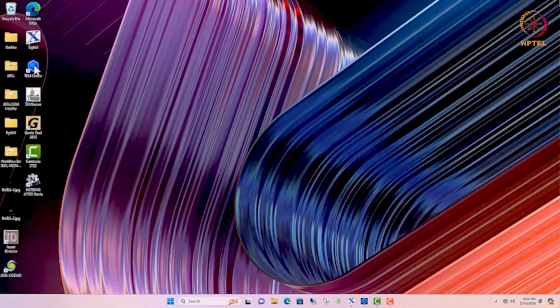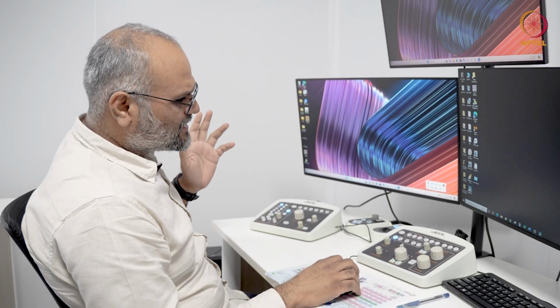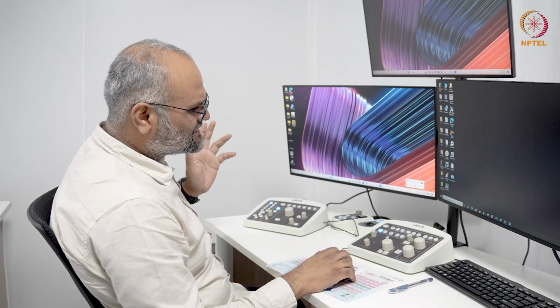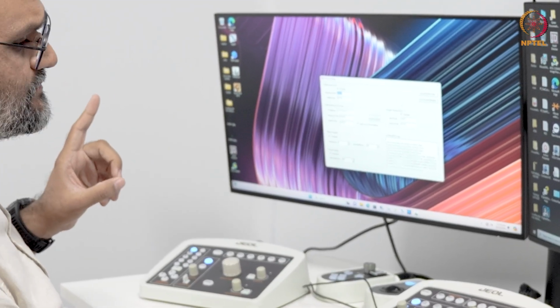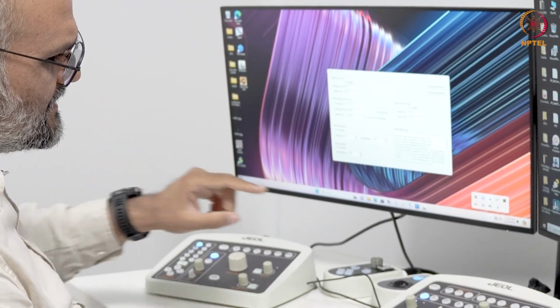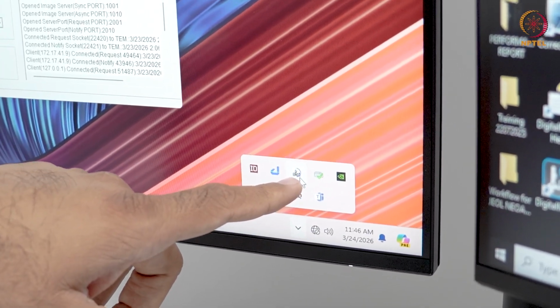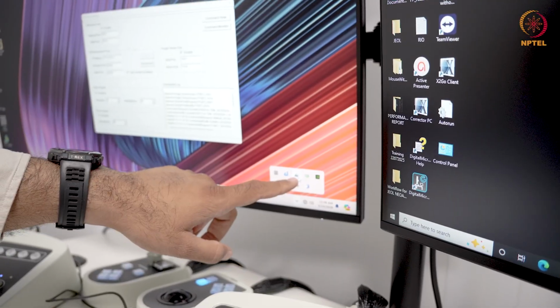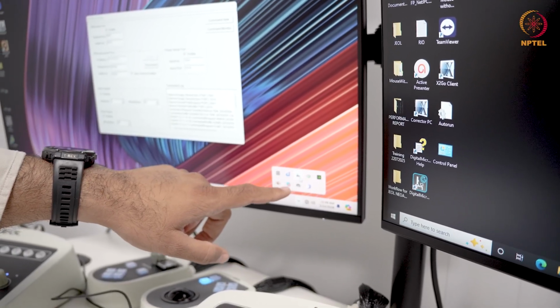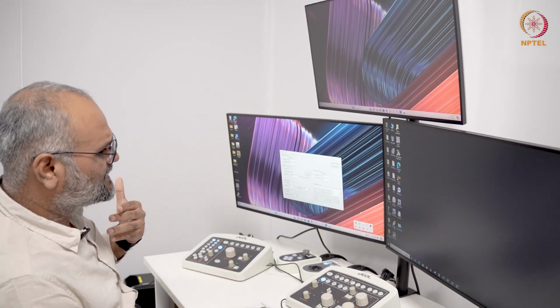Like I was mentioning, the first software that you see is the TEM Center, which is this blue hexagon that you see here. Please ensure that once you come to the instrument, on the bottom right taskbar, the TEM server is connected and running. If you look at this icon, there is this thing which is turning in circles, and this is an indication that your TEM server connection is established and running properly. Sometimes many problems come when this connection is not proper, and you may have to restart the PC or reset the panel on the microscope.